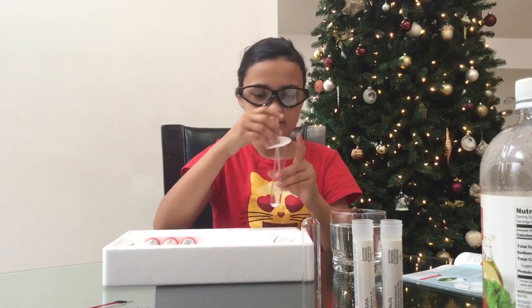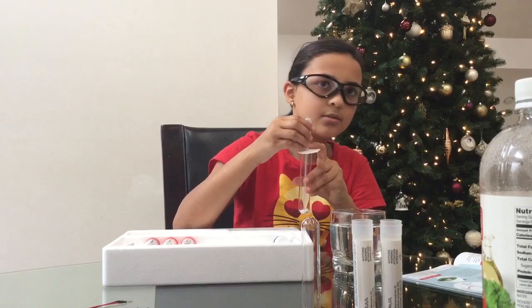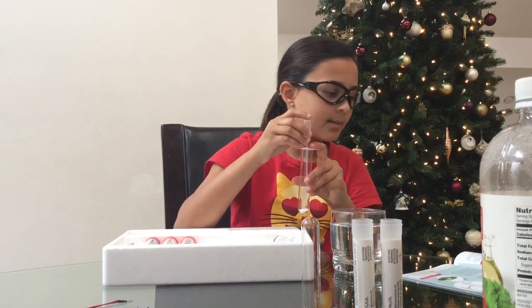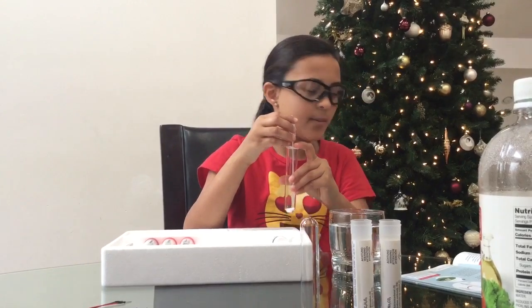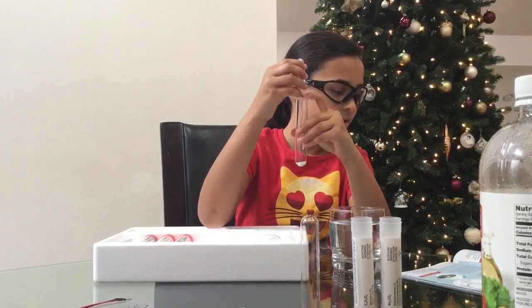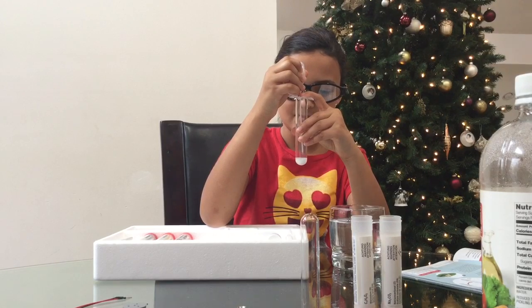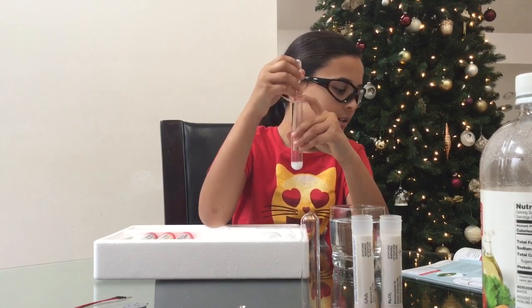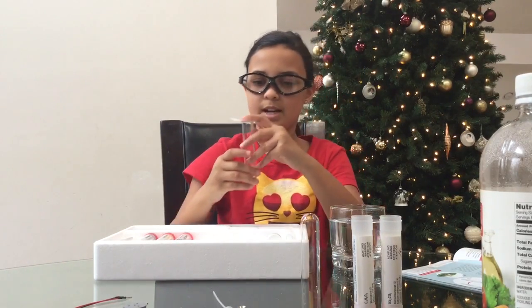You might want to see this part because it's supposed to foam up — don't squeeze it. So you slowly drip water into it and you can see the foam. Then you wait about 10 to 15 seconds for it to subside — stop bubbling.